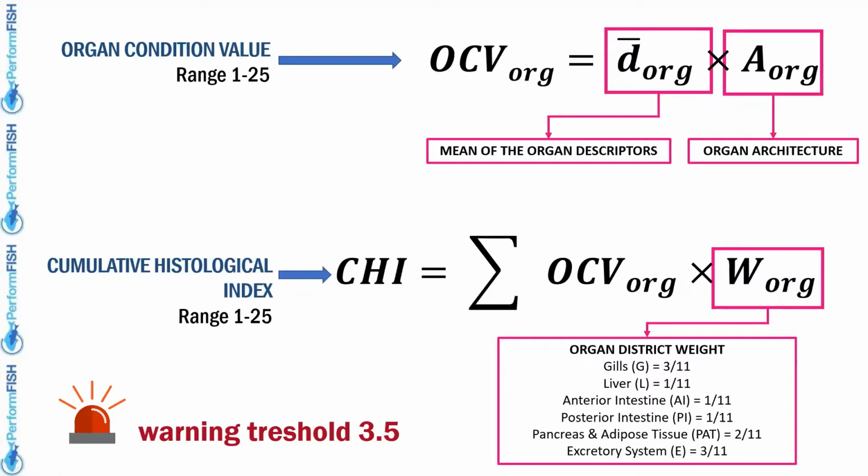After several virtual score simulations, the threshold was set at 3.5, and it should be the alarm bell or warning for the fish being evaluated, and thus, of course, for the fish farmer, so that action can be taken before the situation becomes excessively severe or irreversible.